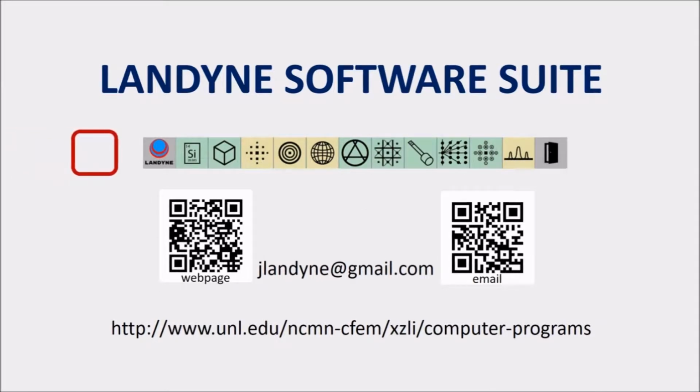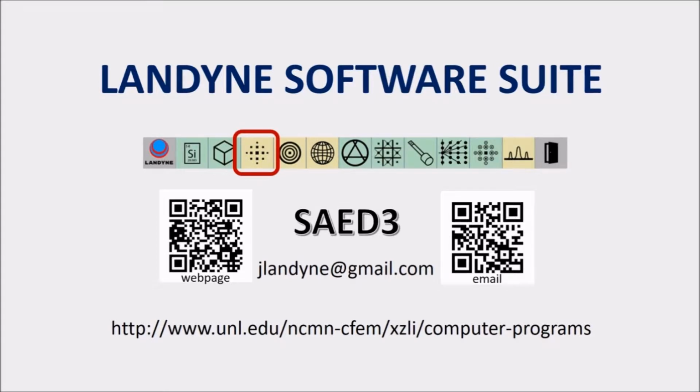We already explained the installation of the Java runtime environment and the Java Advanced Imaging, together with the Landyne software suite, in the first video of the series. Please refer to the video if you haven't watched it.